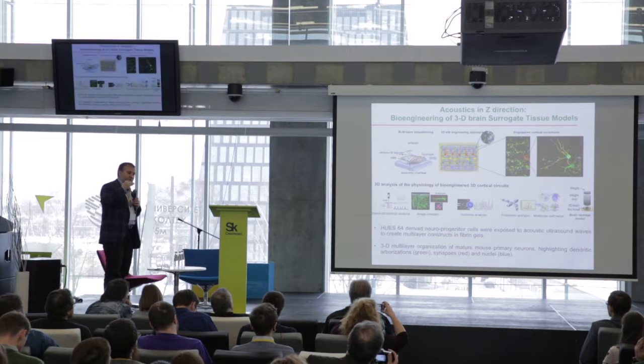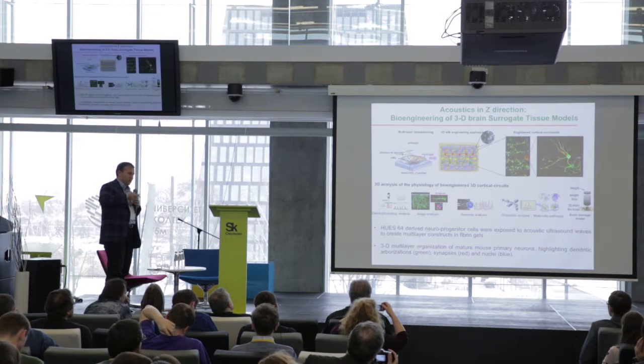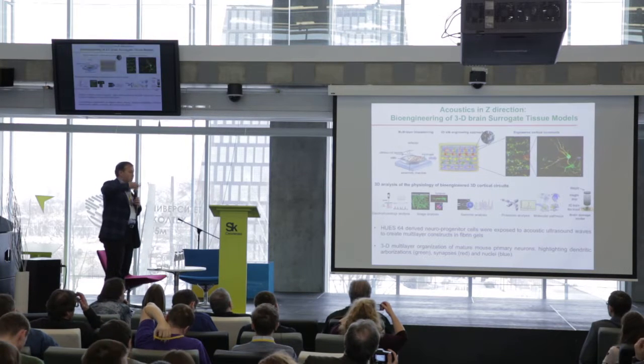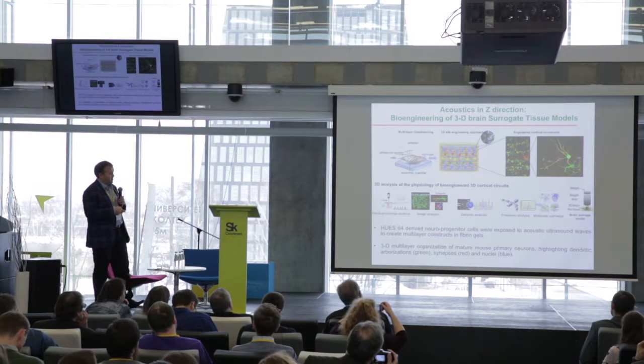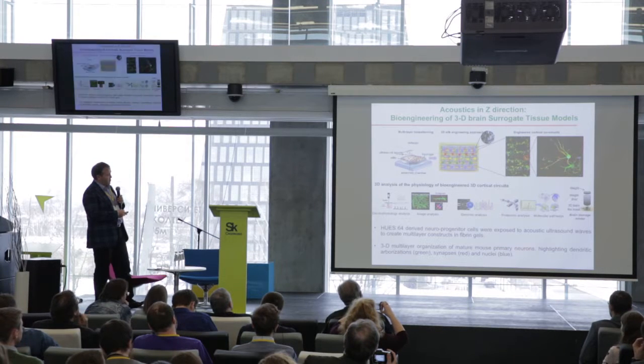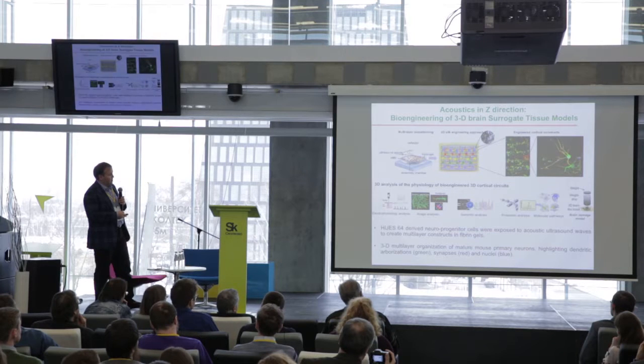Or we also started thinking about if we could control, again using acoustic waves, in the Z dimension, if we could make things multi-layer, or multiple layers, by again using acoustic resonances, not only in X, Y, but in Z. So there we built a system, and this one is not based on vibration, but it is actual piezo sending acoustic waves that travel to a reflector on the top and then bounce back. So now the standing waves are in the Z direction. This allows us to create nodes and anti-nodes, as many as we want, depending on the wavelength and the length. And you can that way assemble cells into multiple layers. And I'll show you more of these.